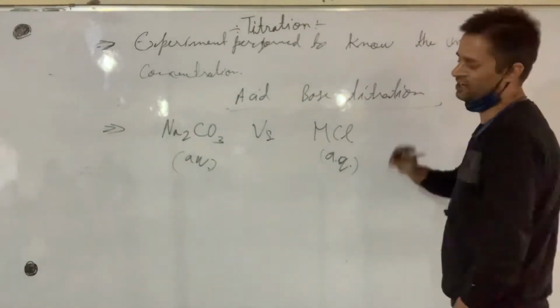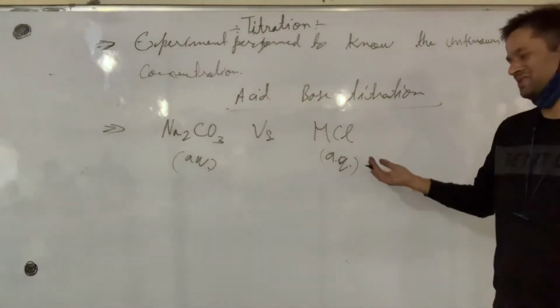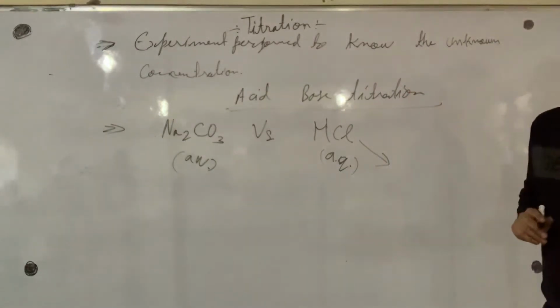Versus HCl titration we will do today. Okay. And which one is acid, which one is base? We know HCl is an acid, and HCl is a strong acid.